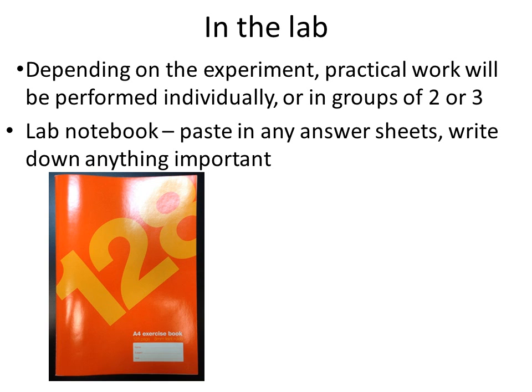You'll be given a lab notebook that looks something like this. You must record all your data in the notebook and write down anything that you think is important. If you want to query a mark or ask a question, you must bring your notebook with you so that we can check what you actually did in the lab.